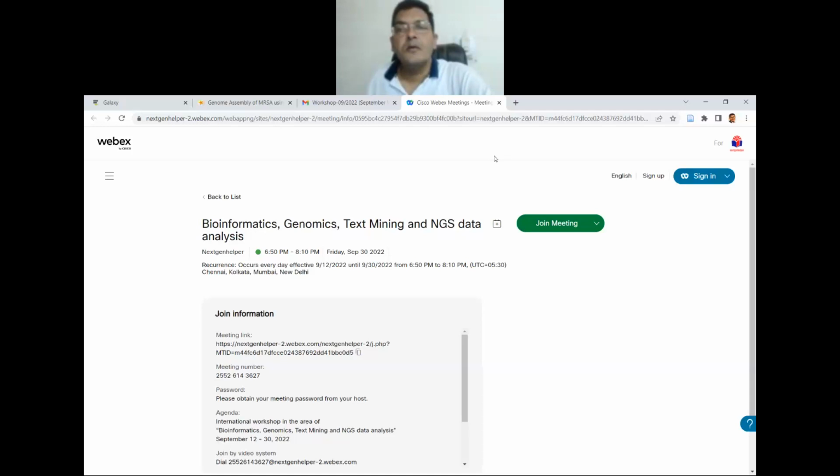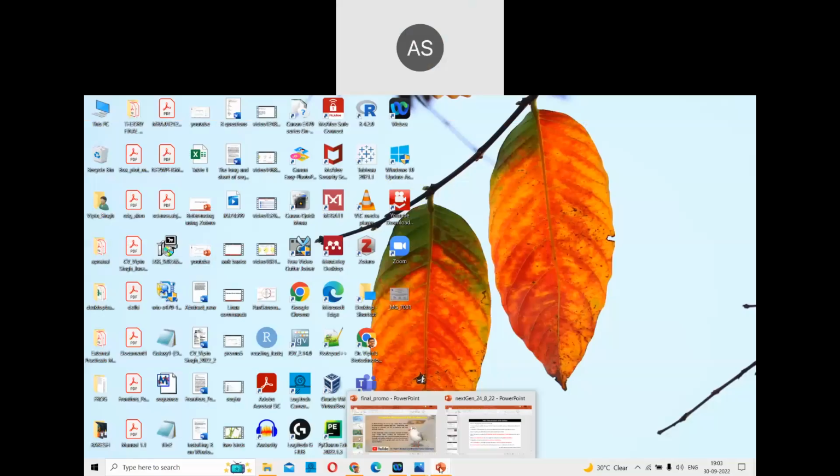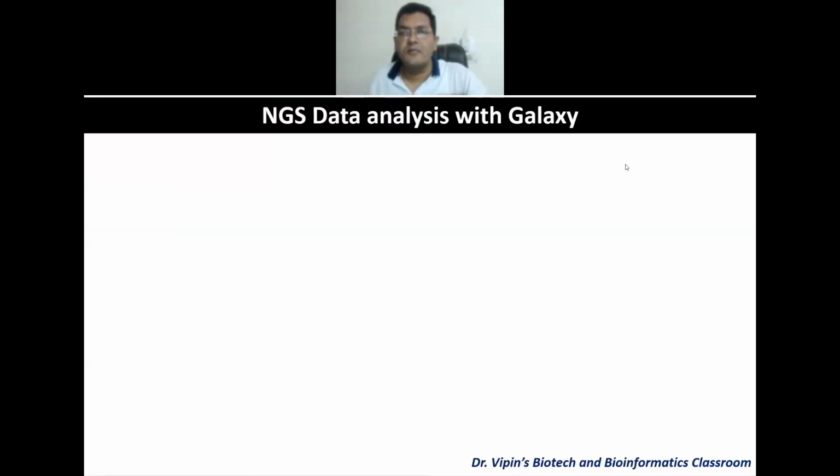Sir, excuse me, sir. Yeah. Sir, I was able to install my Galaxy, but in Windows, not in Linux. There I was having some problems. You're able to install your Galaxy in Windows? Yes, sir. So which is fine. So you did a local installation, you mean? Sir, actually, the .org site is not supported in my Linux. That's why I was not able to access that. I see. Okay. So for now, you do it online, and then we'll see how we can go about it, right? So here we are.